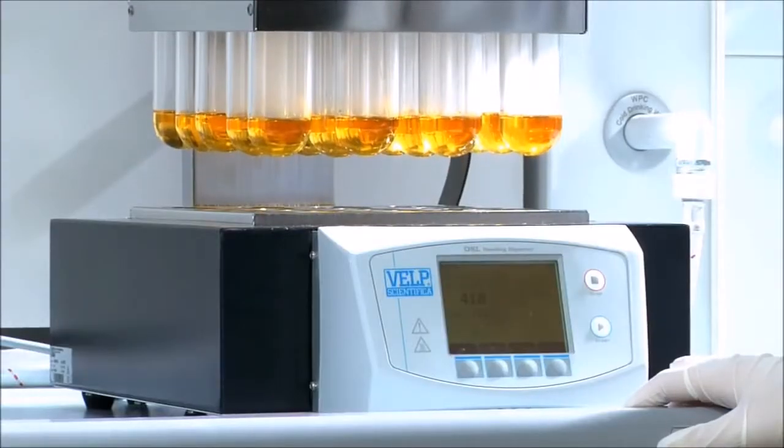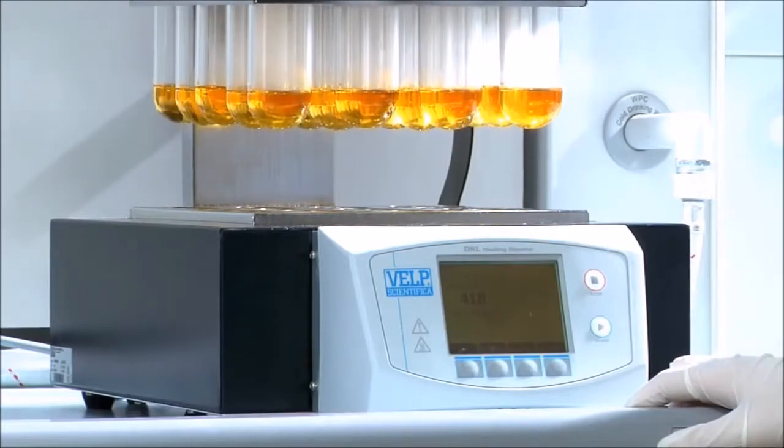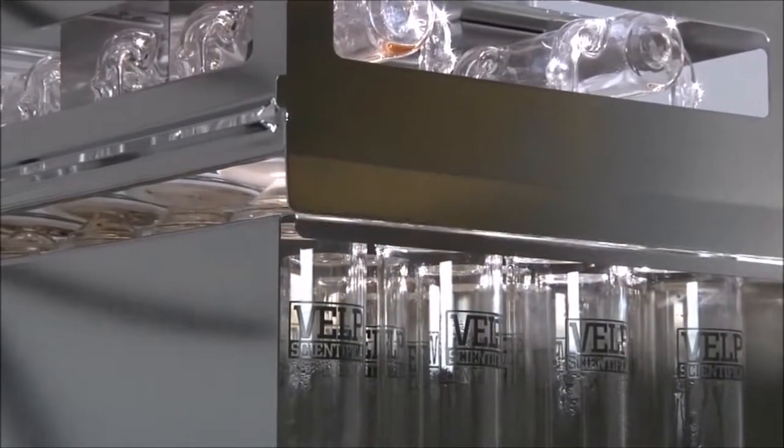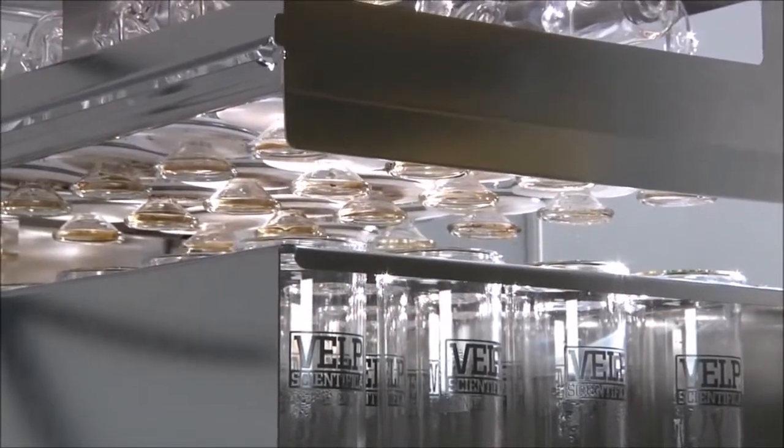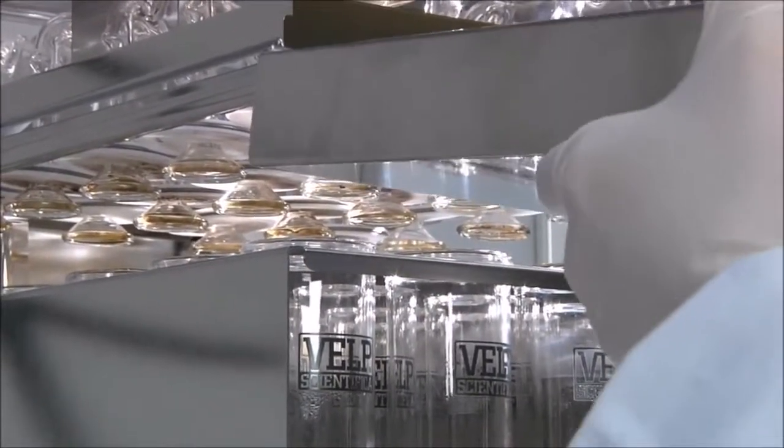Once the operator is ready to proceed, he can automatically separate the rack from the suction cap. Now it is possible to slide the rack out and replace it by another in order to start the next run, increasing productivity.